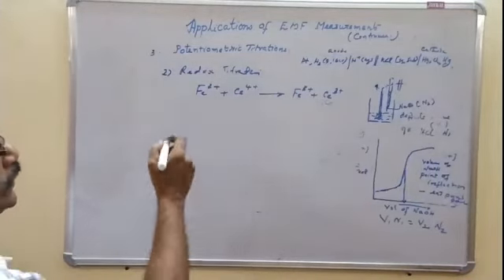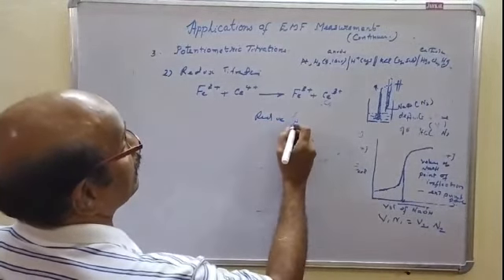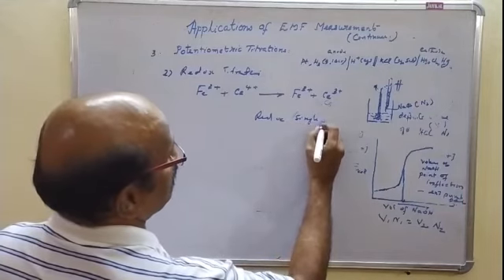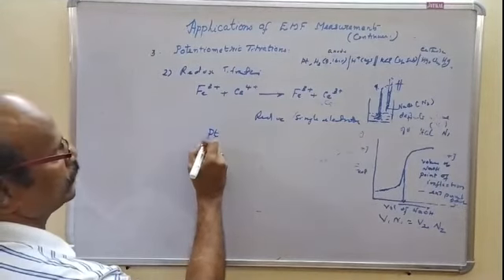So here we have used a redox single electrode as the indicator electrode.